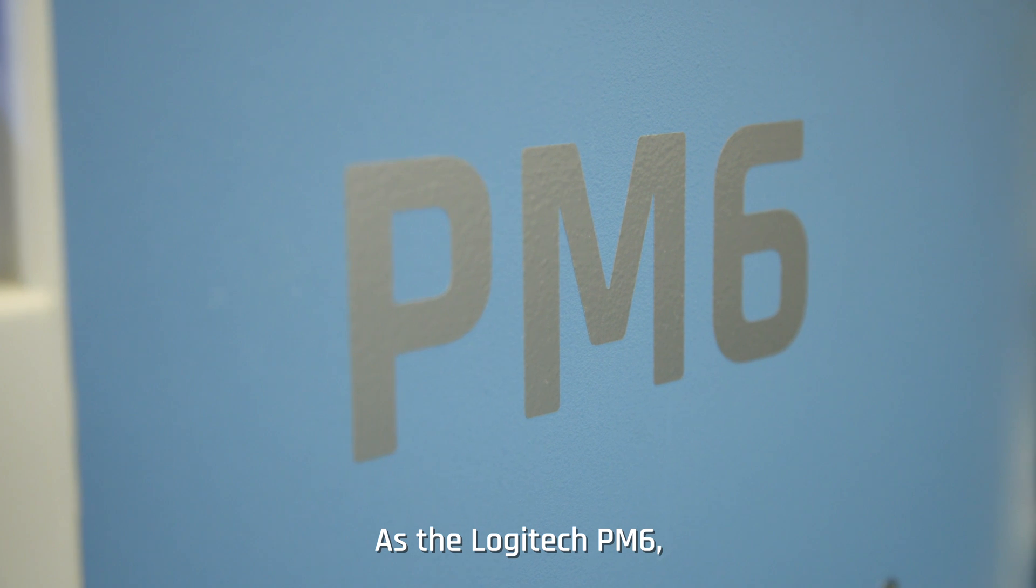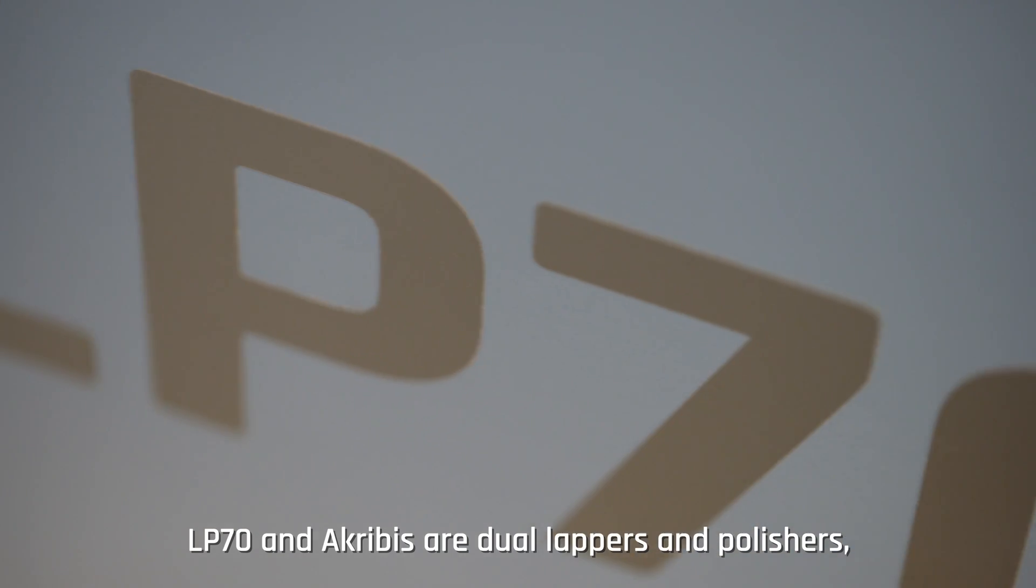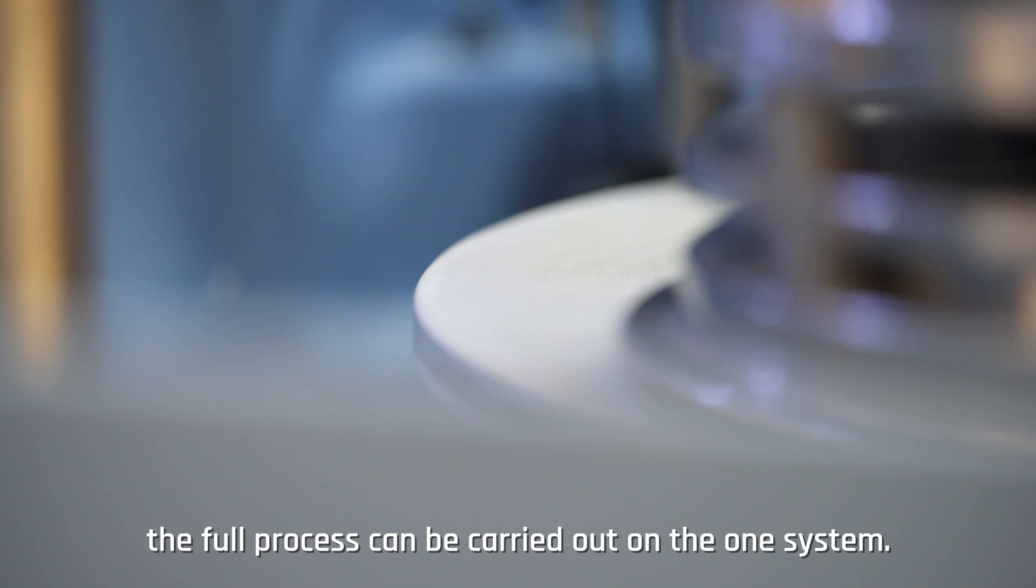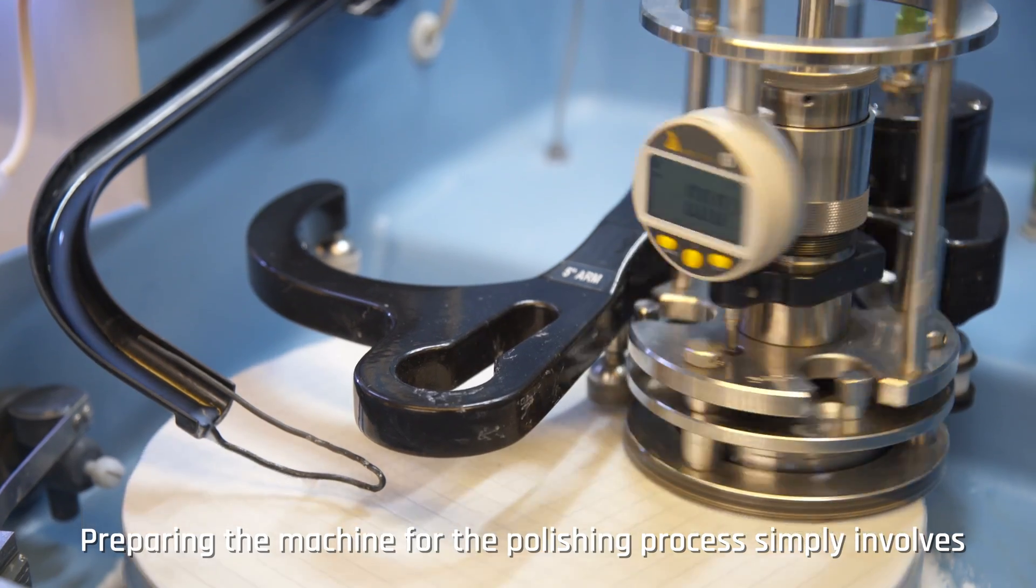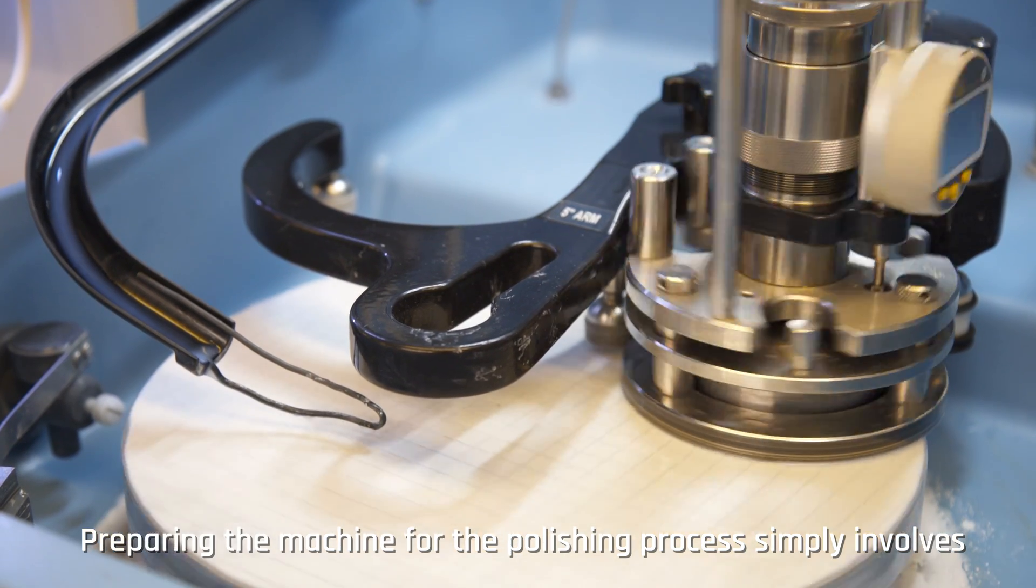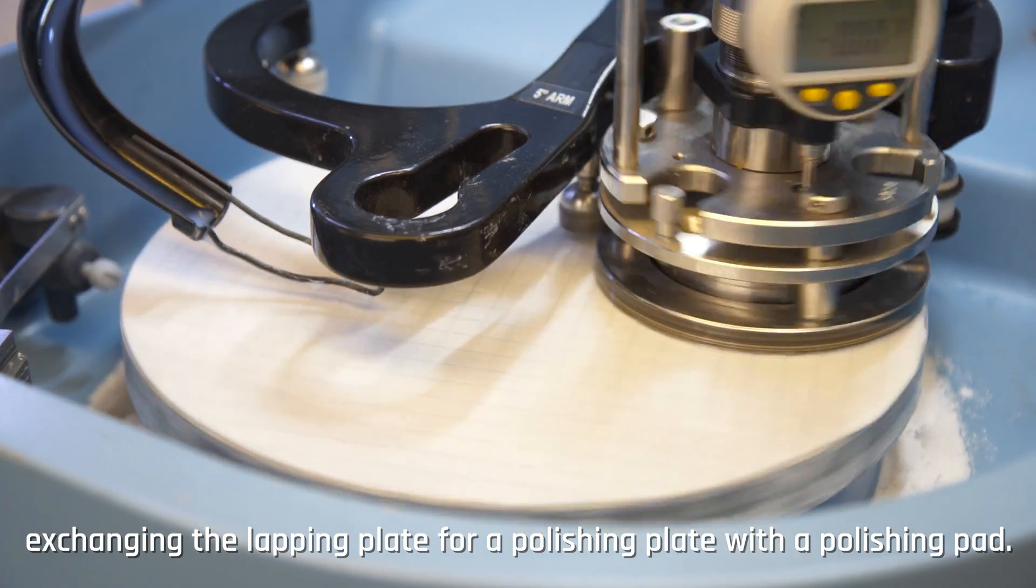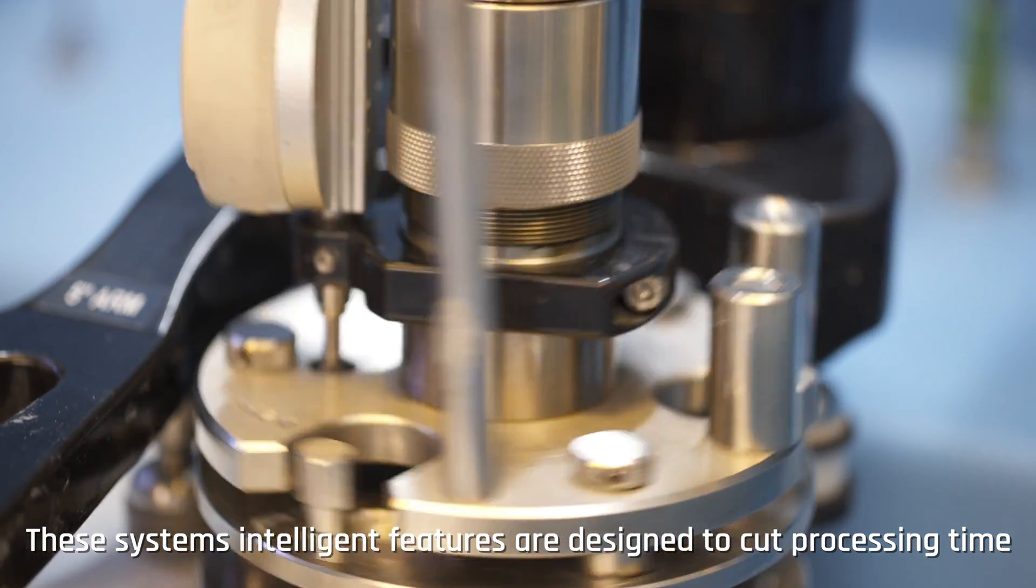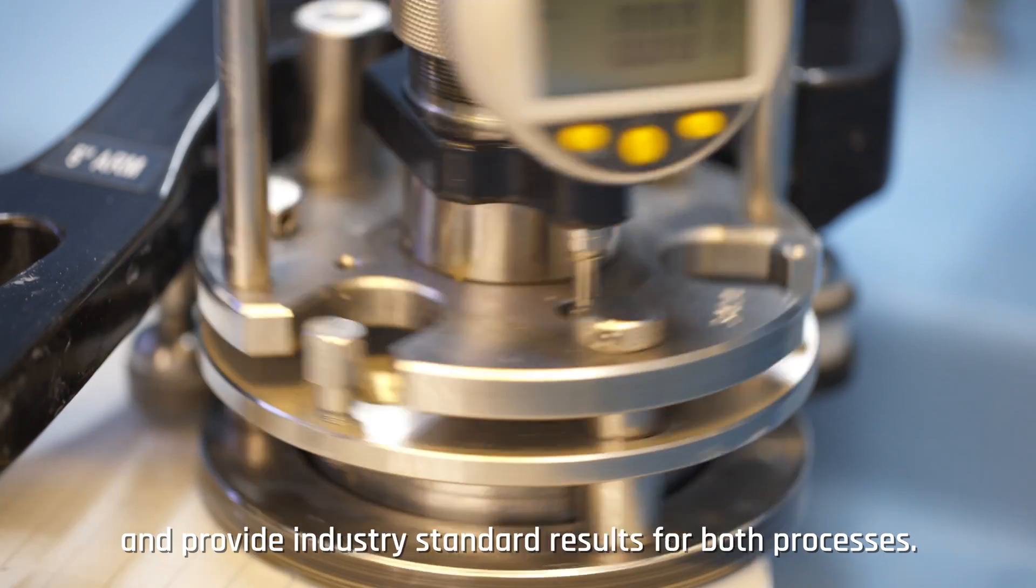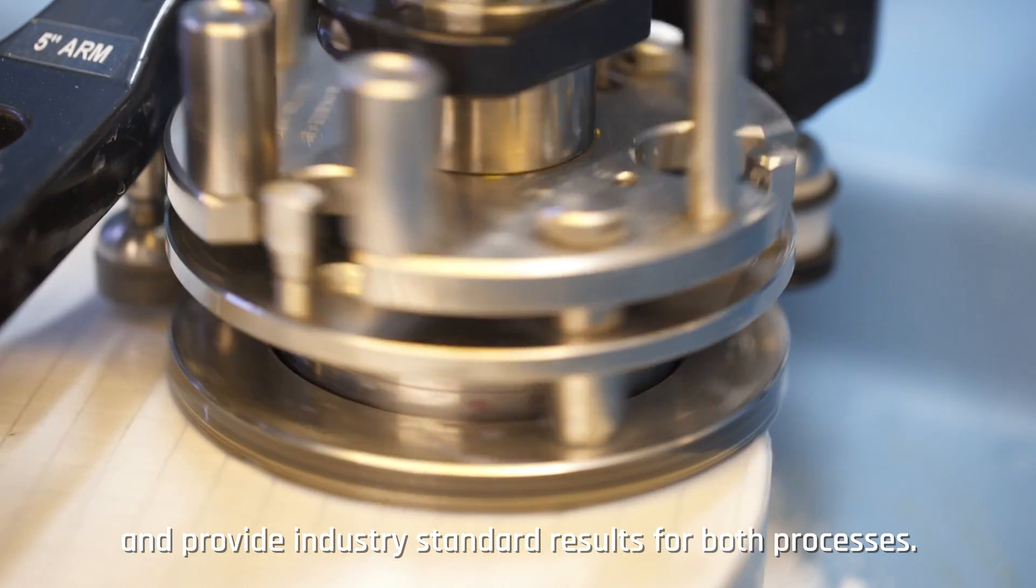As the Logitech PM6, LP70, and Acrobus air are dual lappers and polishers, the full process can be carried out on the one system. Preparing the machine for the polishing process simply involves exchanging the lapping plate for a polishing plate with a polishing pad. These systems' intelligent features are designed to cut processing time and provide industry standard results for both processes.